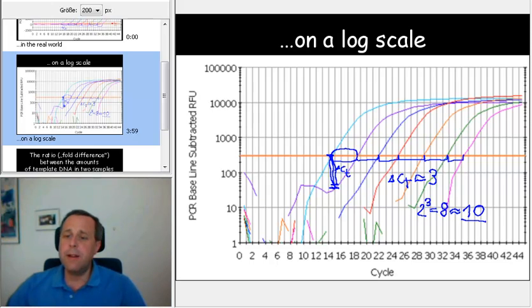So what you are looking at now, guess what it was? It's a 10 fold dilution series. So this sample had the highest amount of your PCR template. This one had 10 fold less and again 10 fold less and again 10 fold less and so on.